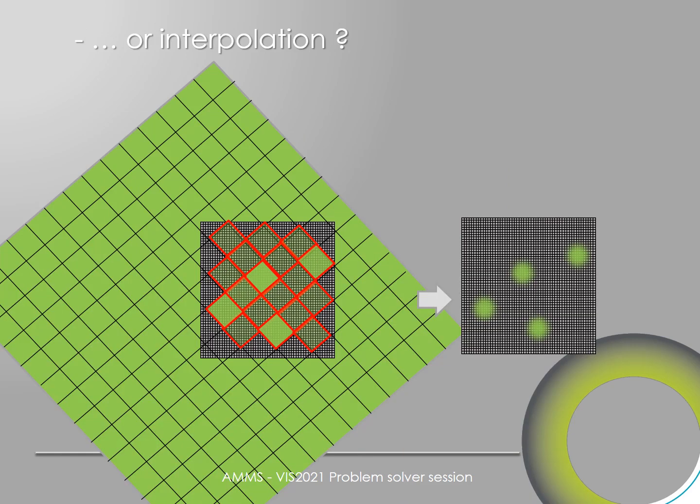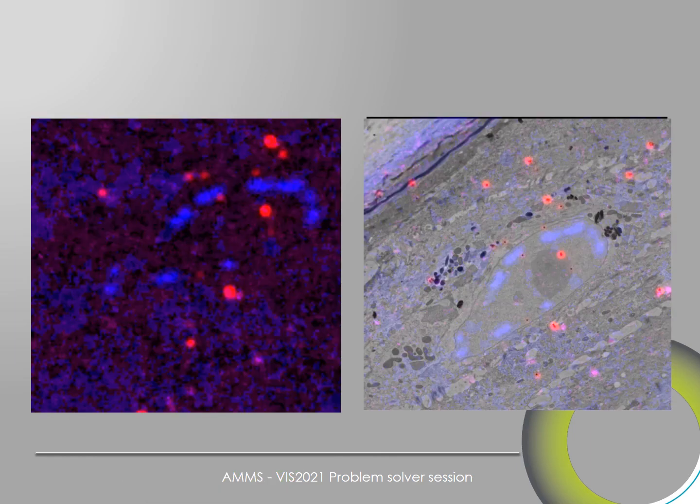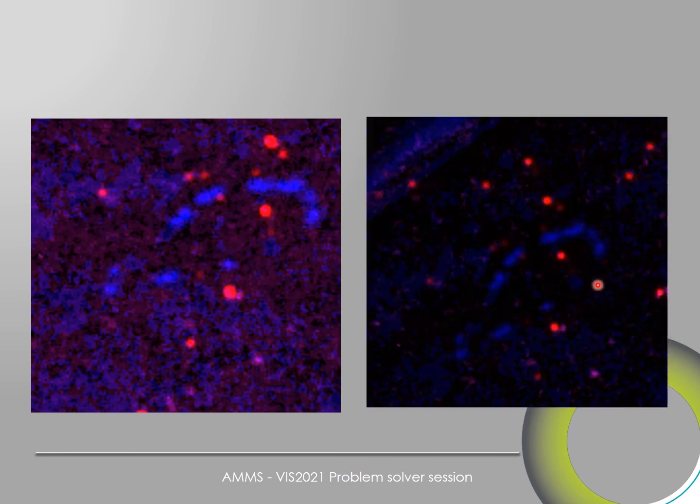On the other hand, you can also do the interpolation. Basically, you can multiply the number of pixels and calculate their center of mass, and interpolate them on the electron image. This is the kind of image you would get then, where basically the image you have here has been interpolated here. And we see that the precision is much finer than in here because we reduce the intensity of the pixels by the factor of the interpolation.